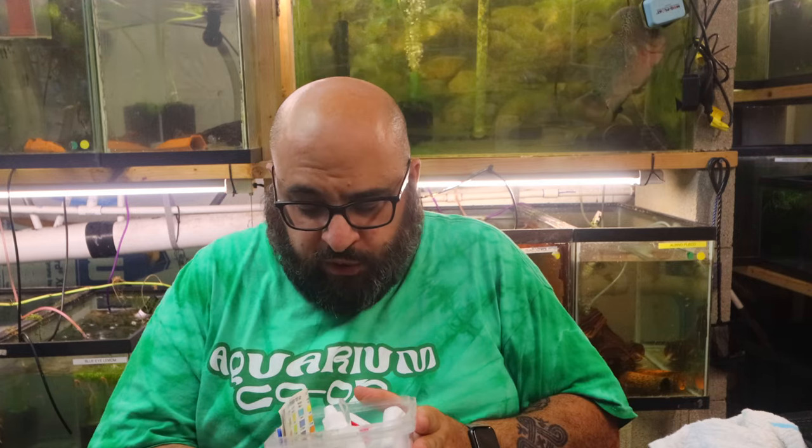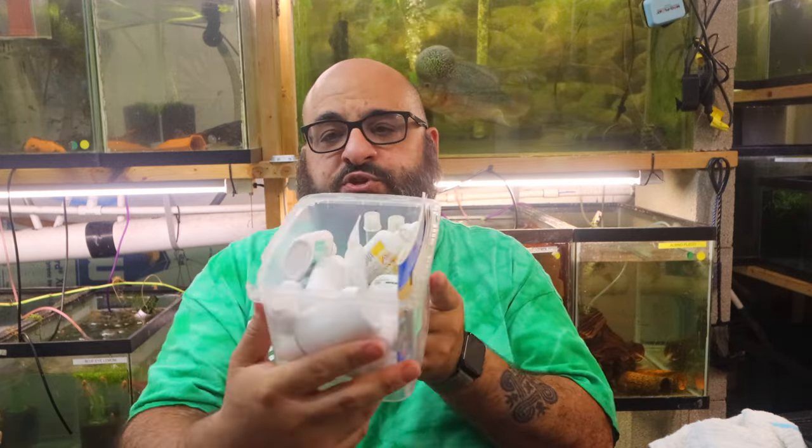The API kit is very popular — most of the hobby uses it or has used it at one point. Everybody knows what you're talking about if you show a picture of the glass tubes with all the colors in them. The test comes with a color chart and instructions, little glass test tubes. Most of the liquid tests require two separate liquids to make the test work. A simplified version: you put a set amount of water in the tube, add drops of each liquid, shake it, wait 60 seconds or so, and it produces a color you match to the chart.